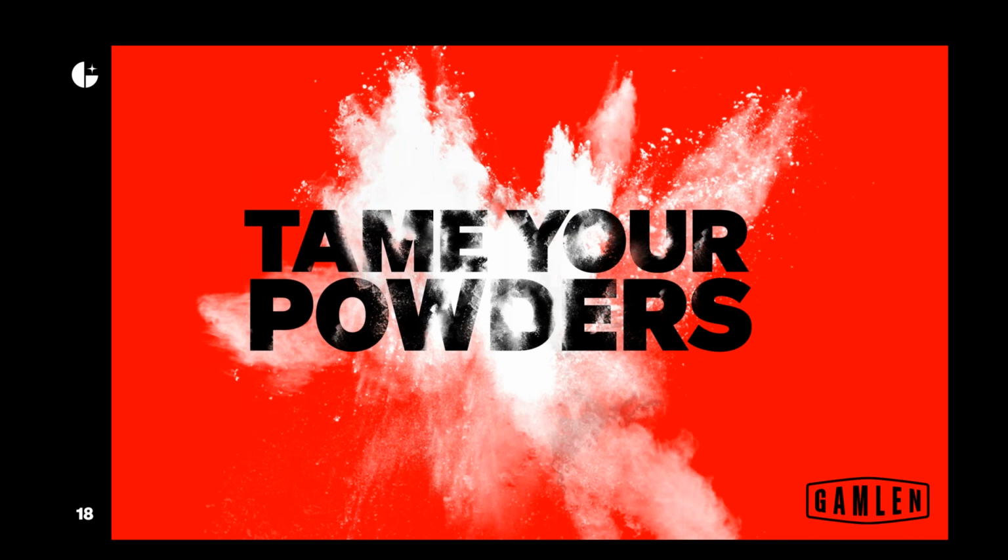And if you think about this equipment, it's very much about understanding the intrinsic compaction behavior of the material. So in that case, it's better to keep one size and shape. If you understand how the material compacts, independent of its size and shape, then you don't need to match the size and shape that you have in production. Our calculations take account of that anyway, so there's no need to match it.